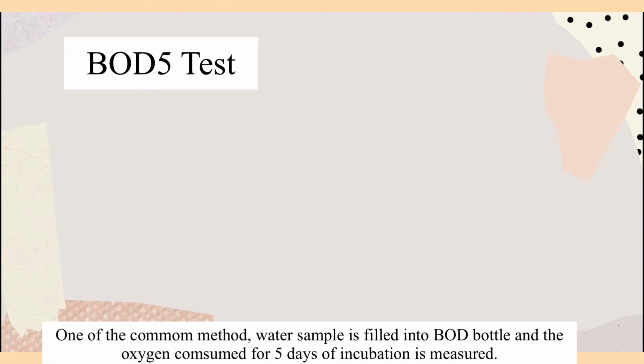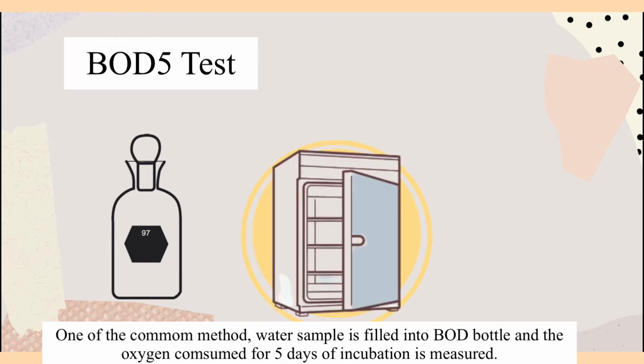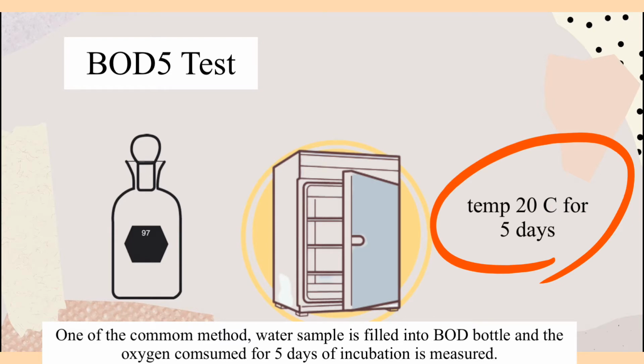The most common laboratory test method is called the BOD5 test. In the BOD5 test, the water sample is filled into the BOD bottle and the oxygen consumed over the 5-day incubation is measured.